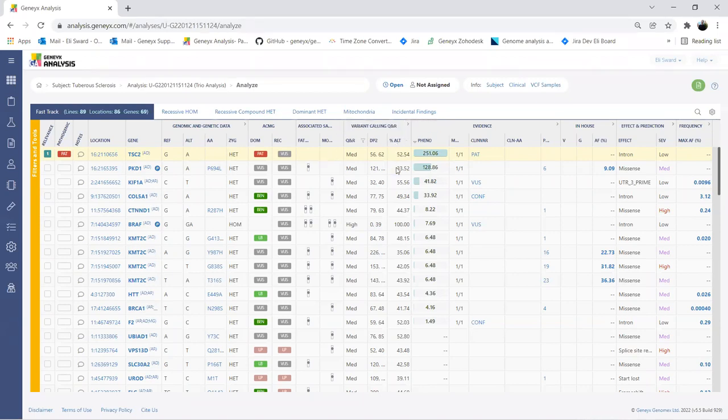We have the variant calling Q&R, which is pulling in relevant information from your VCF file. So if you want to go into more detail and look to see if there's maybe some strand bias, et cetera, or look at the variant allele frequency, you do have the capability to do so. But one of the highlighting features of the Geneyx analysis is definitely our phenotype-driven interpretation tool.